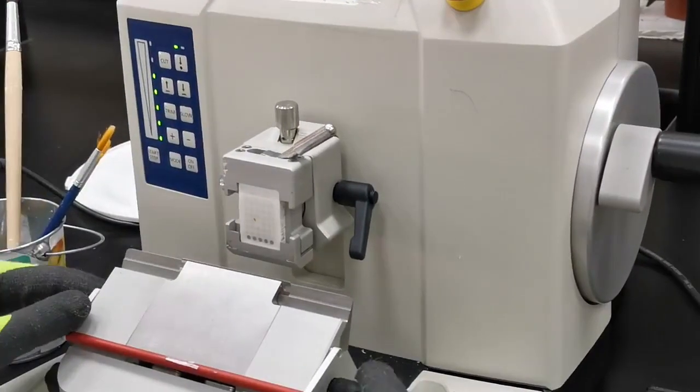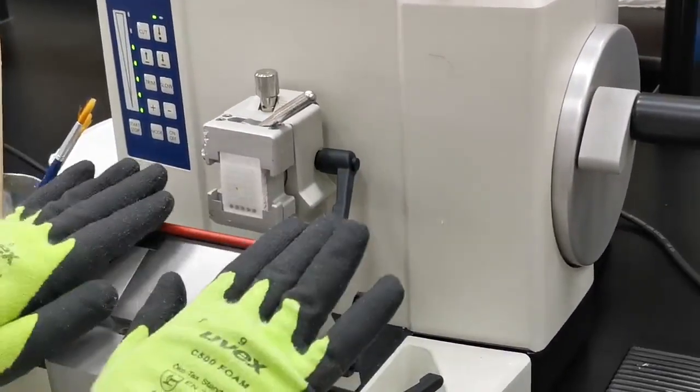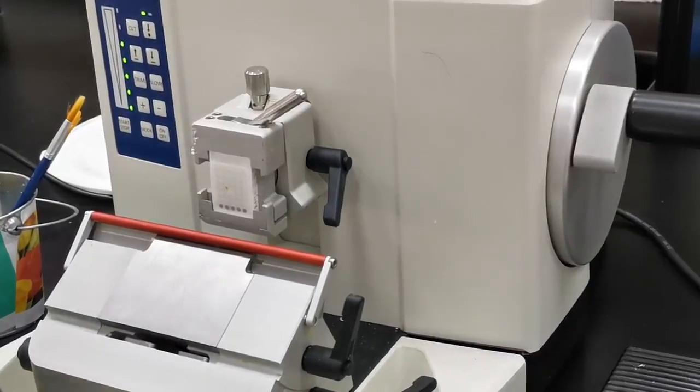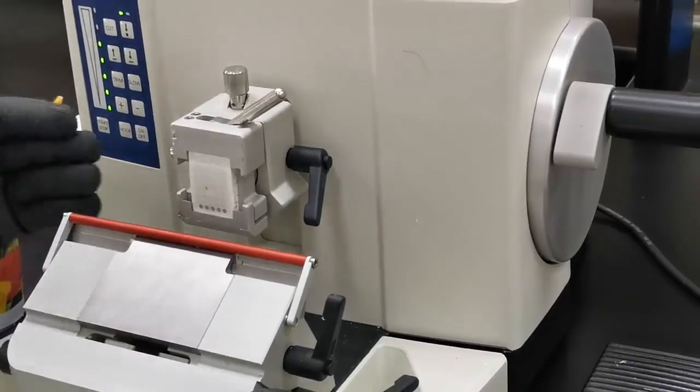Tighten the knife position, and then the first thing to do is cover it with the safety cover. Now I'm ready to do the alignment. I will either move the knife to be near the section, or move the section forward toward the knife.